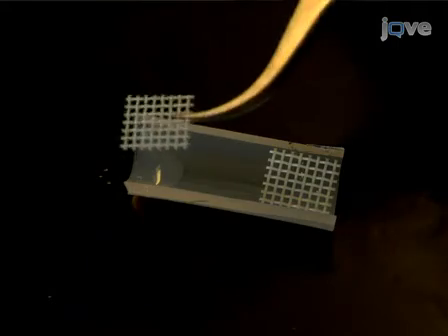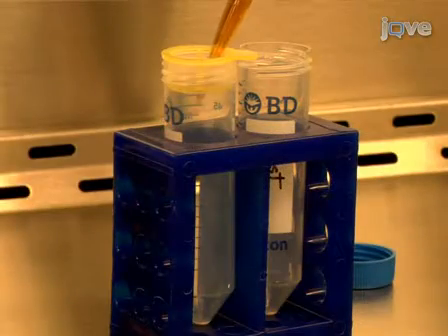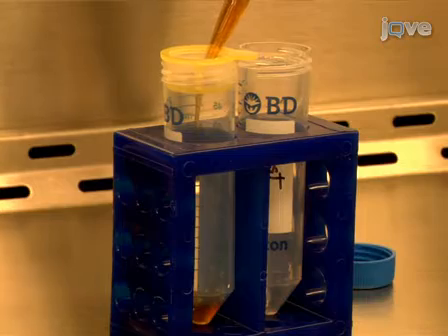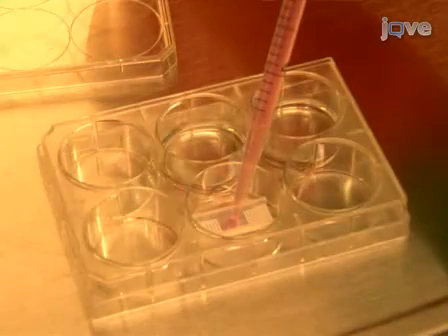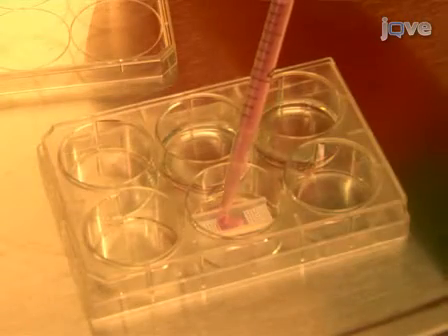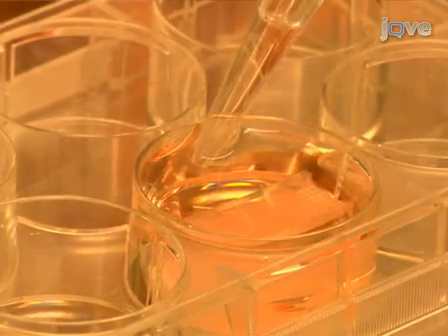I'm Christina Pesak from the laboratory of Douglas Cowan in the Department of Anesthesiology at the Children's Hospital Boston and Harvard Medical School. Today we will show you a procedure for creating myogenic engineered tissue. We use this procedure to fabricate an engineered tissue for insertion in the heart. Our goal is to create an electrical connection between the upper and lower chambers of the heart as an alternative therapy to cardiac pacemaker implantation in children with complete heart block. So let's get started.